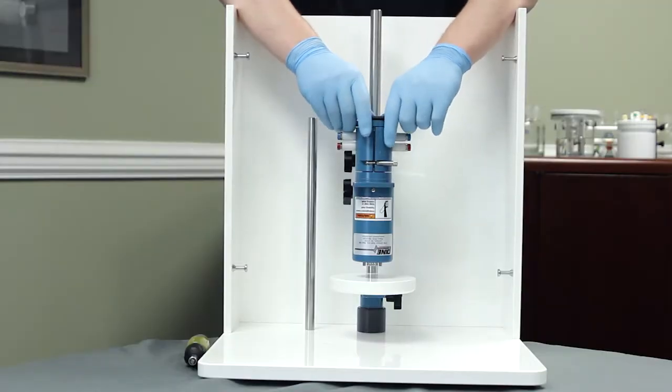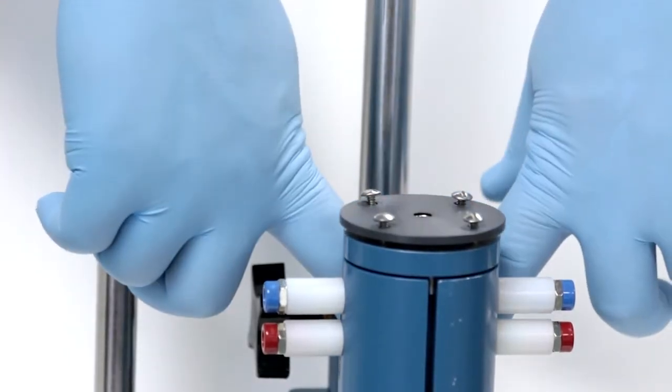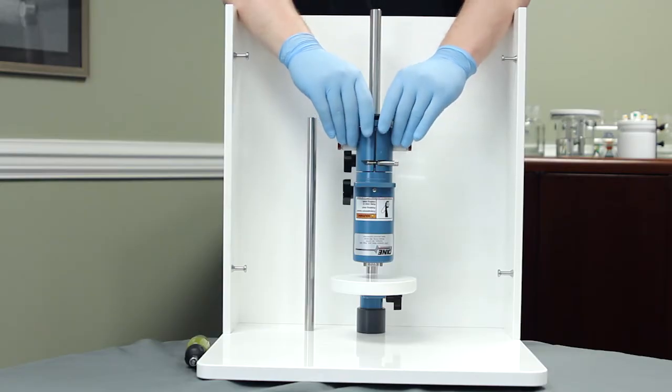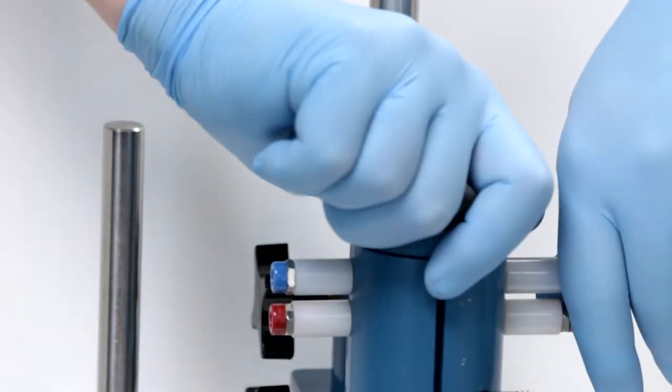Once these are loosened with the screwdriver, the lower bearing assembly will be removed from the base of the motor. You may need to use some back and forth gentle motion to release the lower bearing assembly.